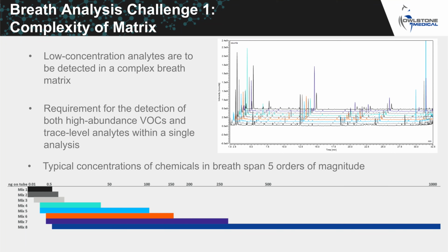So let's start looking at the challenges in breath analysis. The first one, which is a very obvious one, is the complexity of breath as a sample matrix. Here, I'm not going to talk about the sample collection or the clinical challenges, but the analytical challenges of actually analyzing breath samples on TD-GC-MS. As we've seen so far, the breath samples that we collect are complex.